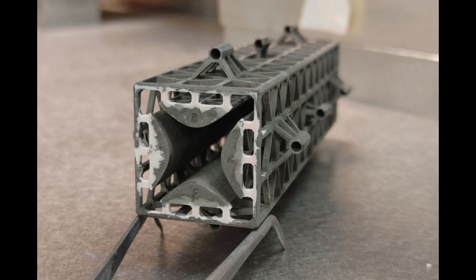A longer filter can enable more precise measurements since more ions that are supposed to be filtered out will escape as the chemical travels along its length. They also intend to explore different ceramic materials that could better transfer heat.